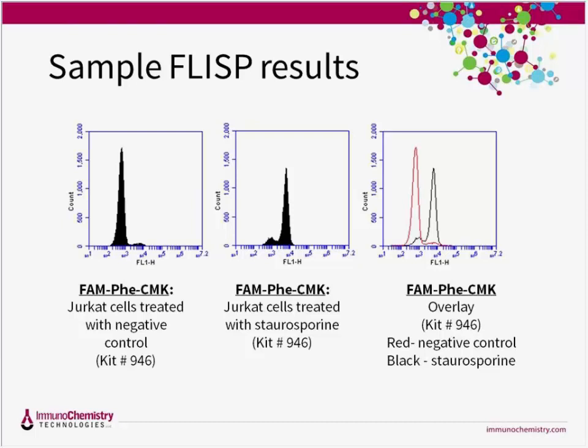Finally, the right panel shows the combined plot. And this is produced by overlaying these two samples. The populations are easily differentiated. This plot clearly shows the increased fluorescence that occurred as a result of the treatment.